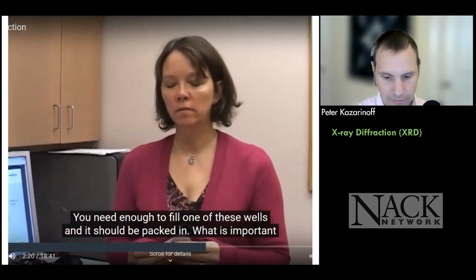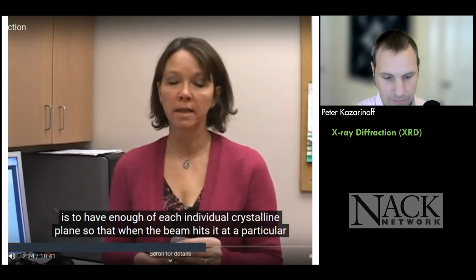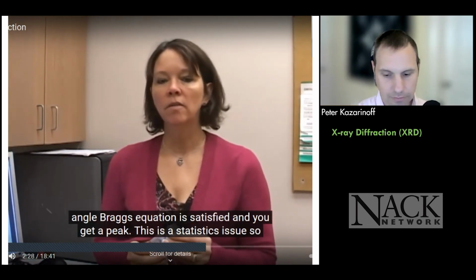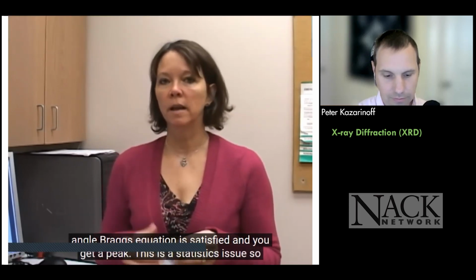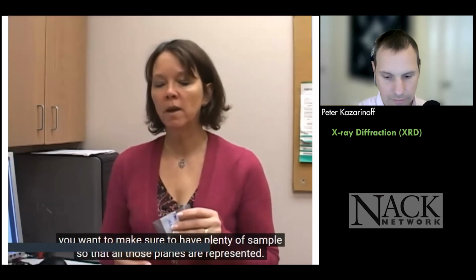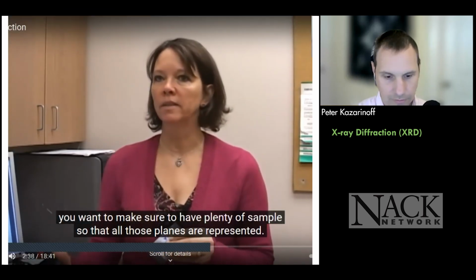And what is important is to have enough of each individual crystallite plane so that when the beam hits it at a particular angle, Bragg's equation is satisfied and you get a peak. This is sort of a statistics issue, and so you want to make sure you have plenty of sample so that all those planes are represented.